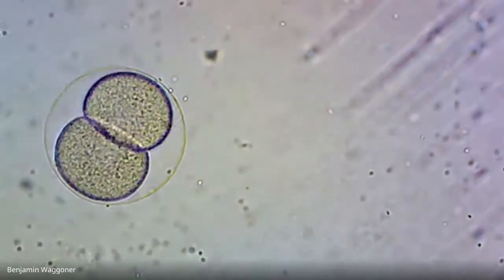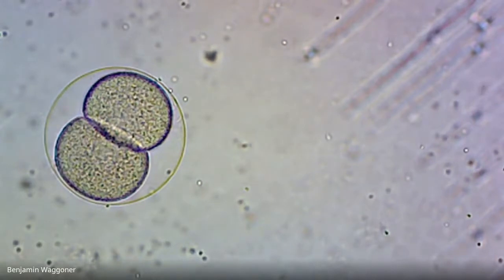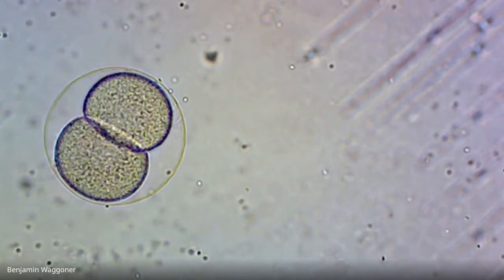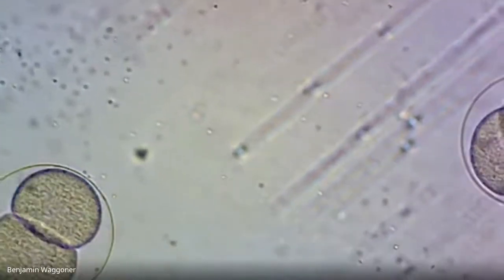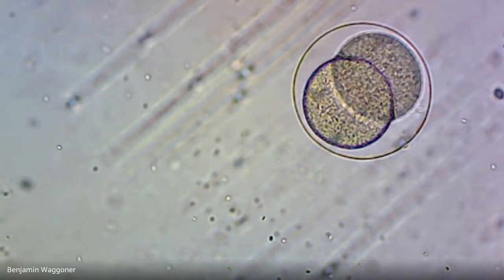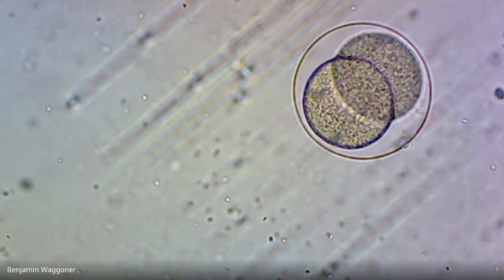And that fertilization membrane is not going to expand. The embryos are going to stay within that membrane until they develop cilia and the ability to swim, and then they'll break out of it. But they're not going to get physically any larger until, in fact, they have developed a gut and are able to start feeding. I don't know if we're going to be able to feed them in this lab, but I'm going to try to keep some and get them to develop as long as I can. So there we're at the 2-cell.